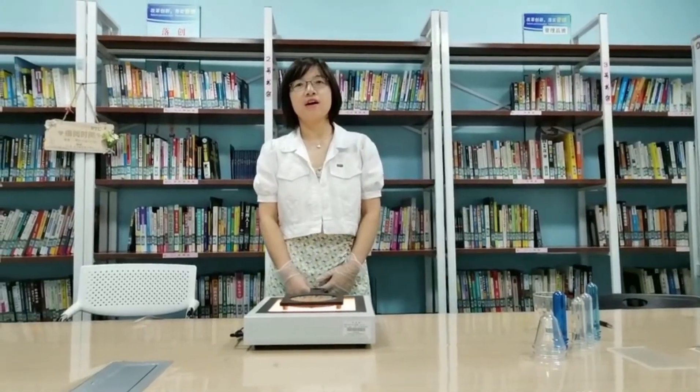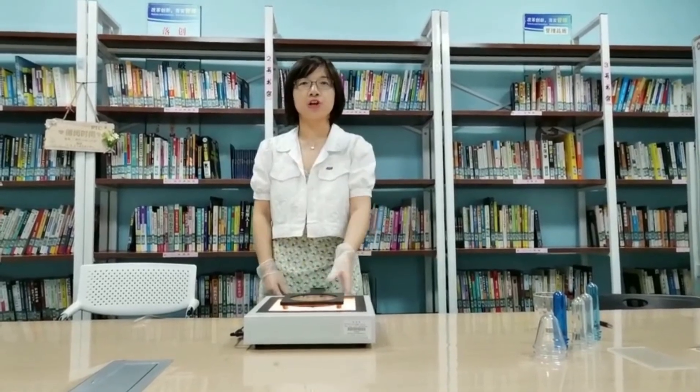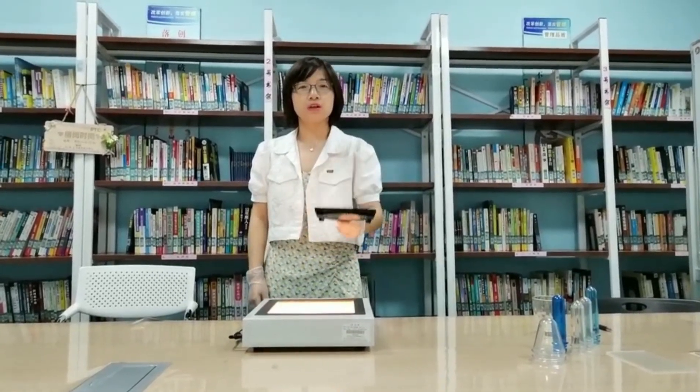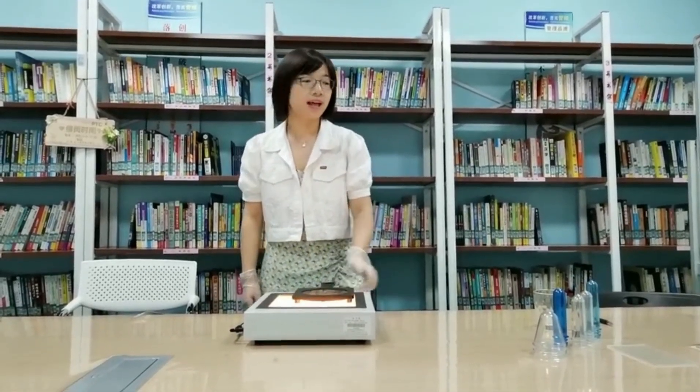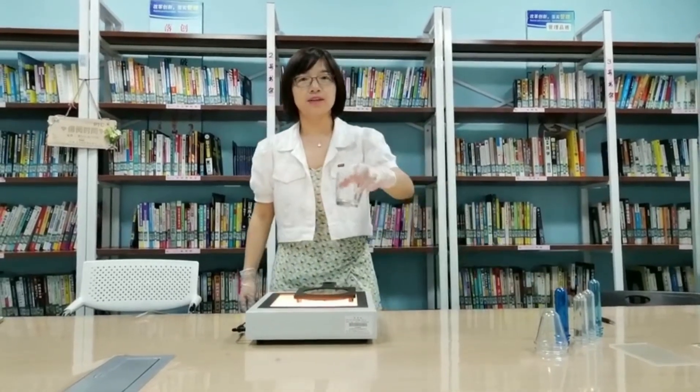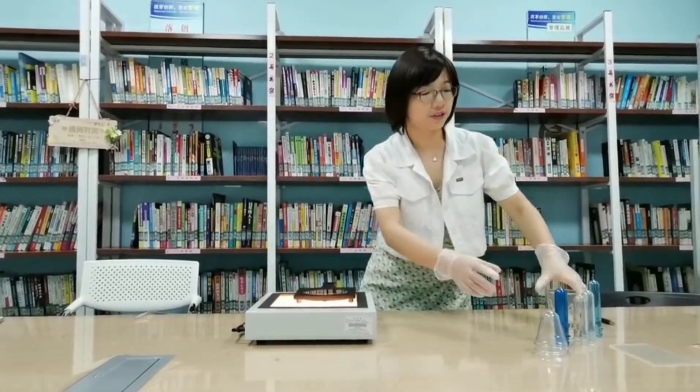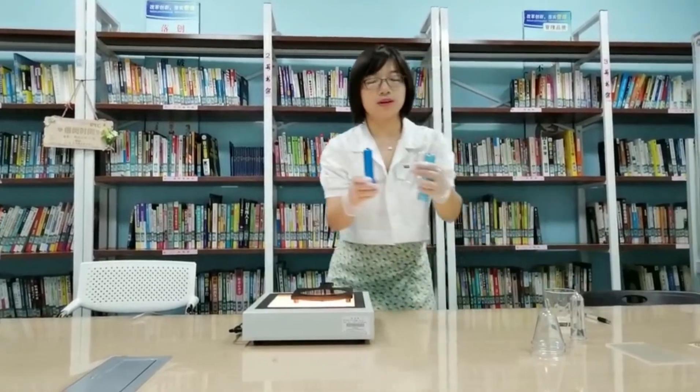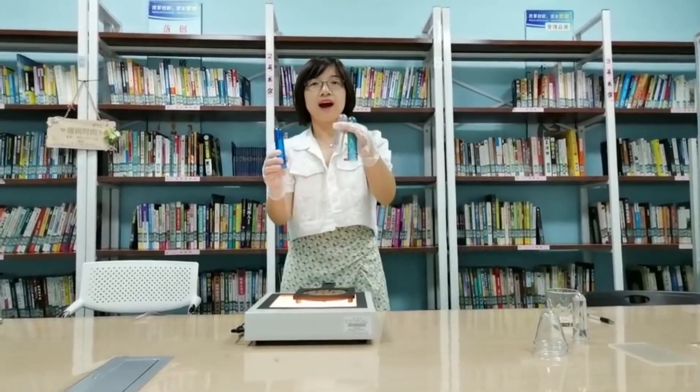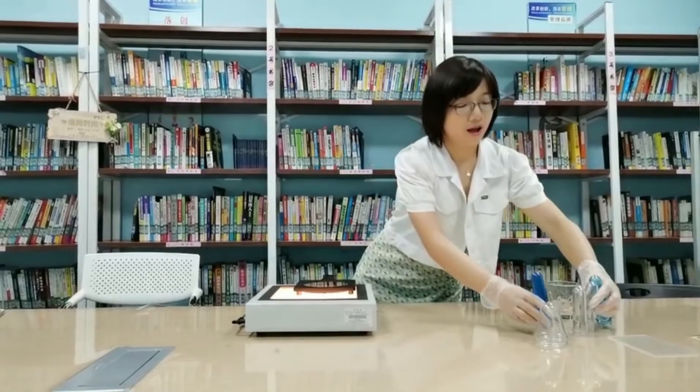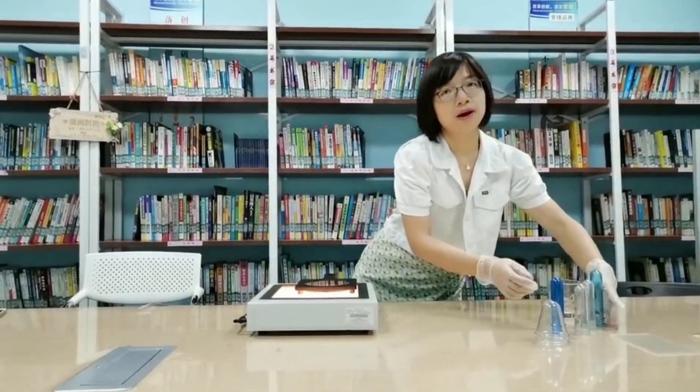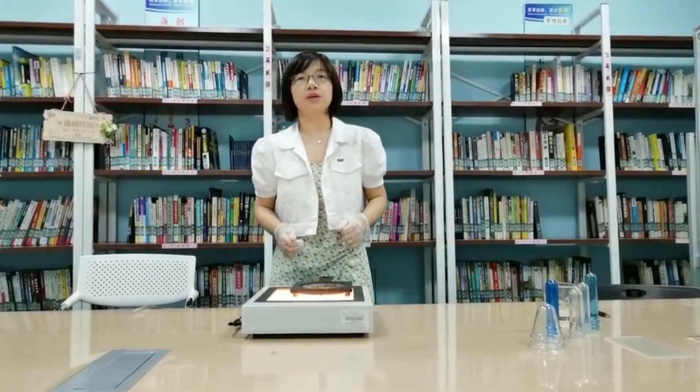In short, this handheld polariscope can be used in the quality control of glass containers like this one, and preforms like this, including colored preforms, other molding parts, and other glass products.